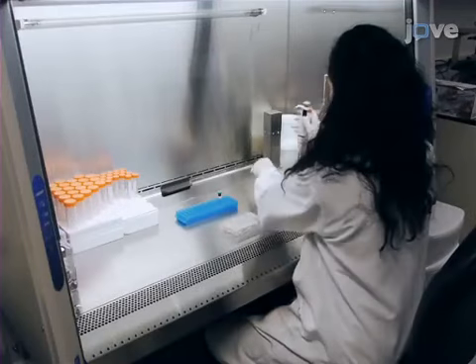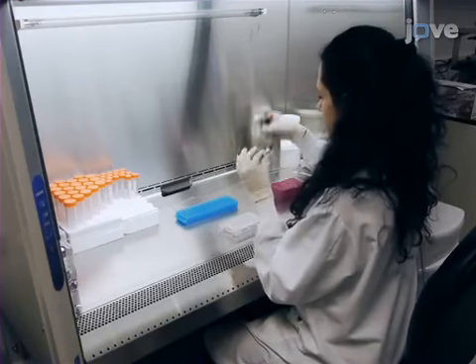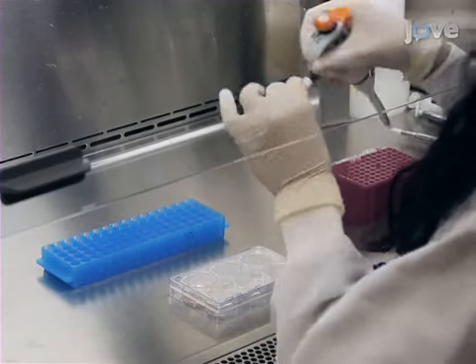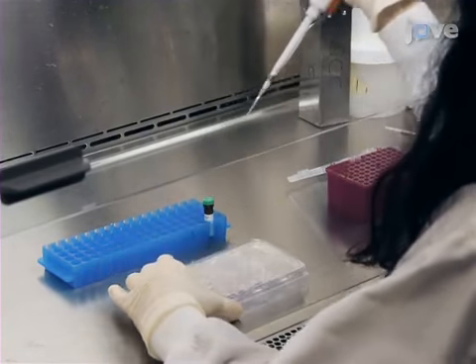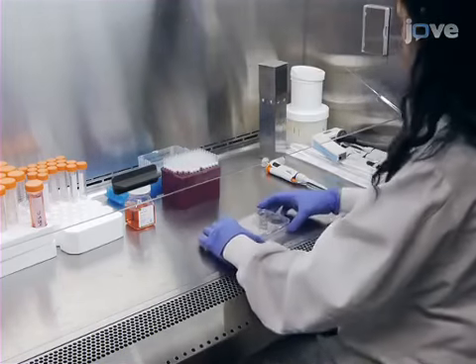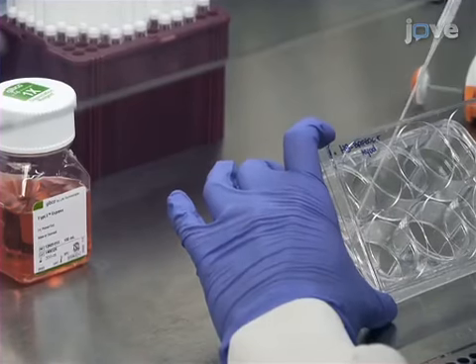The day before the infection, to human embryonic stem cells in 6-well plates, add human embryonic stem cell cloning and recovery supplement to the medium at 1000x for a final concentration of 2 micromolar. The next day, infect the human embryonic stem cells with high-titer BAF60C GFP lentivirus.